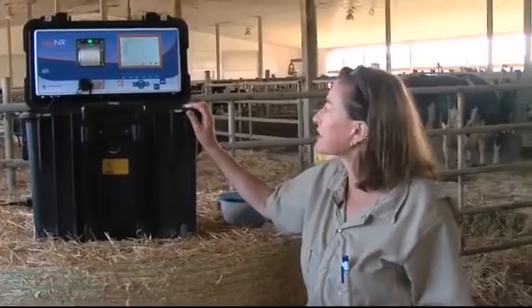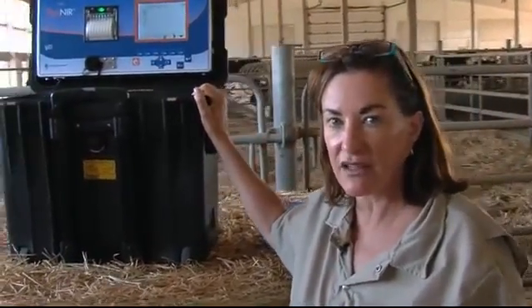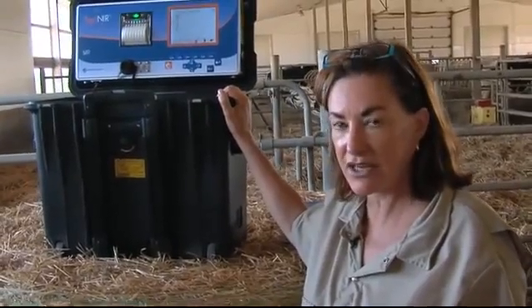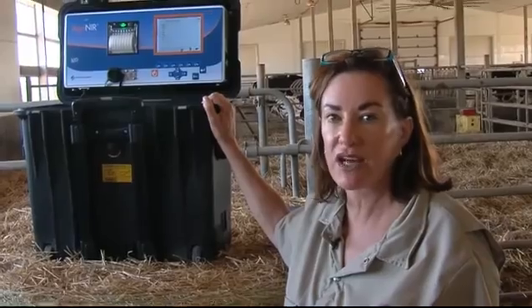Basically what this piece of equipment does is it does approximate or chemical analysis using NIR technology, similarly to what you would get from your local forage analysis lab.